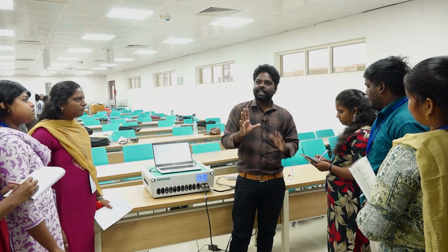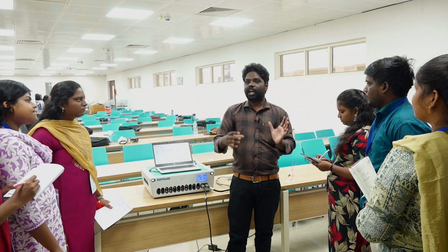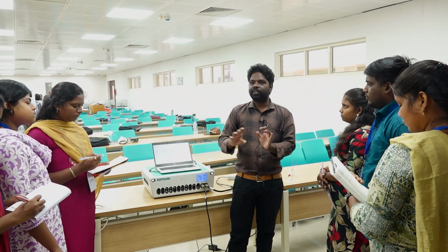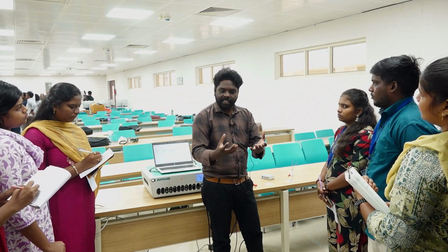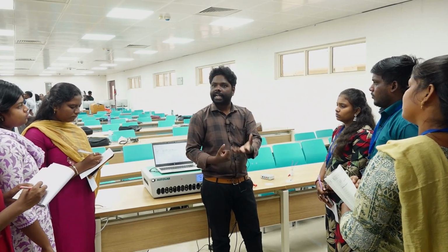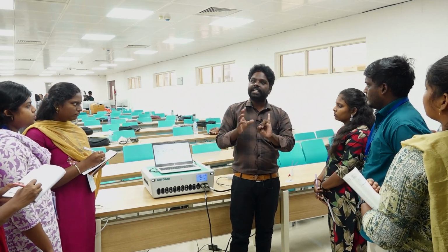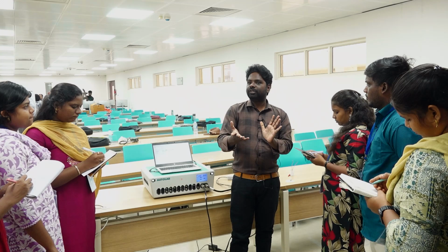Then what parameters can we observe or find out from this EIS? This is very important. We have a sample right now, so what parameters can we analyze from the sample? First thing is internal resistance or solution resistance.